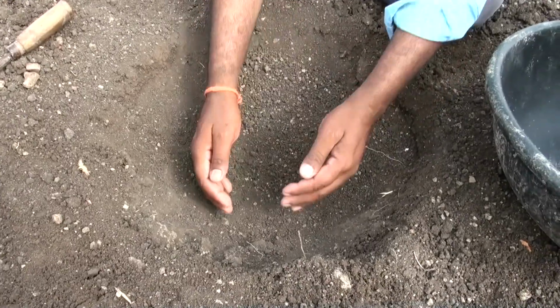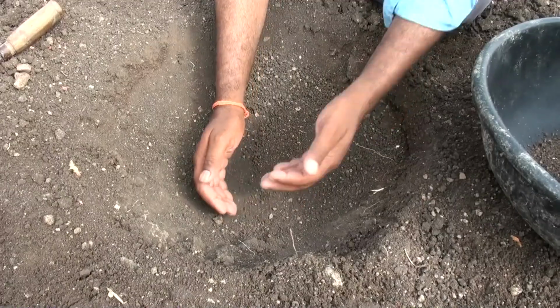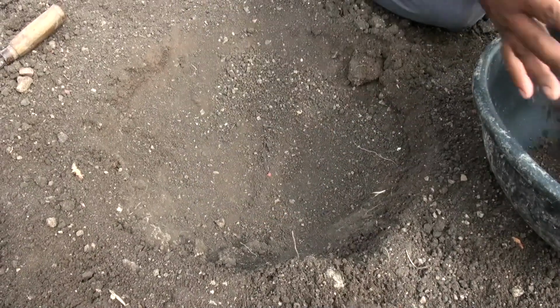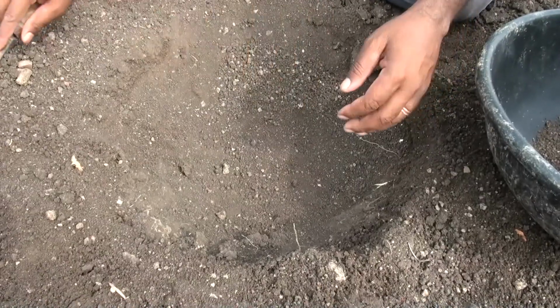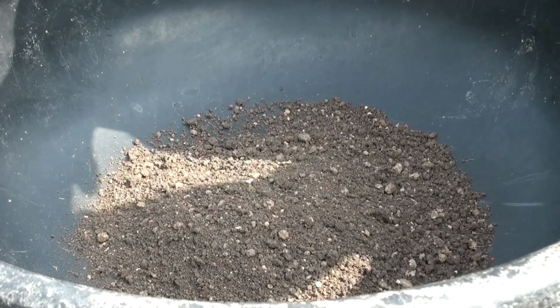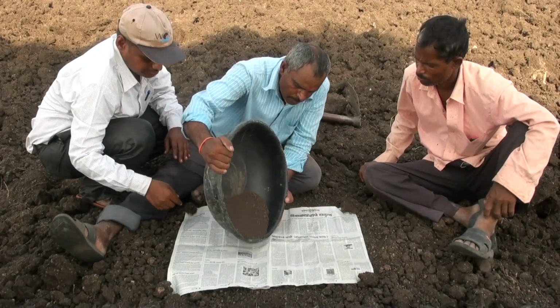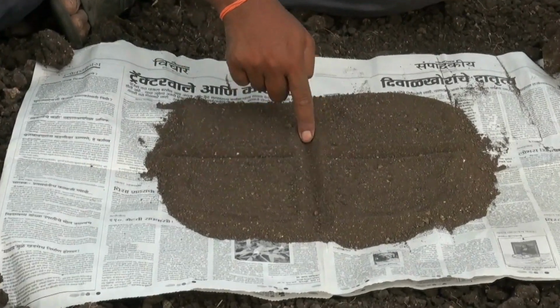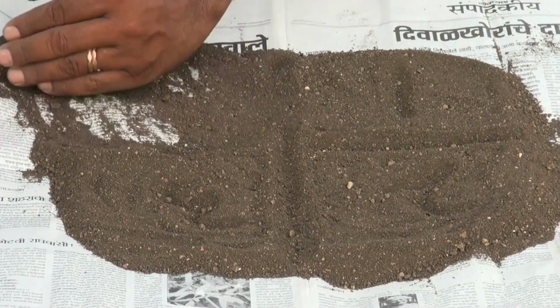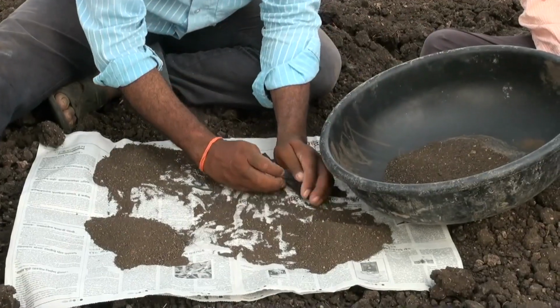Mix the sample thoroughly and remove foreign materials like roots, stones, pebbles and gravel. Reduce the bulk to about half to 1 kilogram by quartering or compartmentalization. Compartmentalization is done by uniformly spreading the soil over a clean hard surface and dividing into smaller compartments by drawing lines along and across the length and breadth.